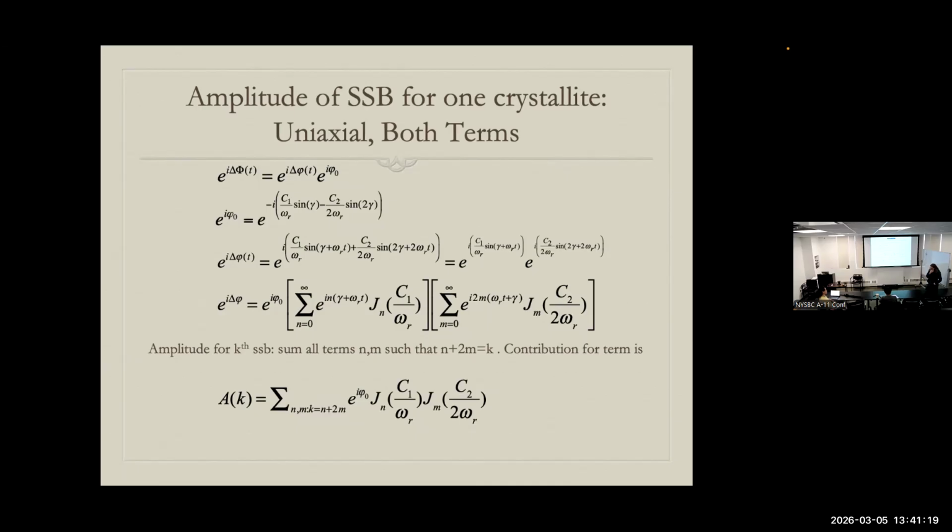But also, sometimes in an advanced pulse sequence, you get weird effects in the amplitudes of cross peaks or other things, because you have more than one anisotropic interaction at work. Let's say you're trying to measure a dipolar coupling, but you also have a strong CSA on top of it.